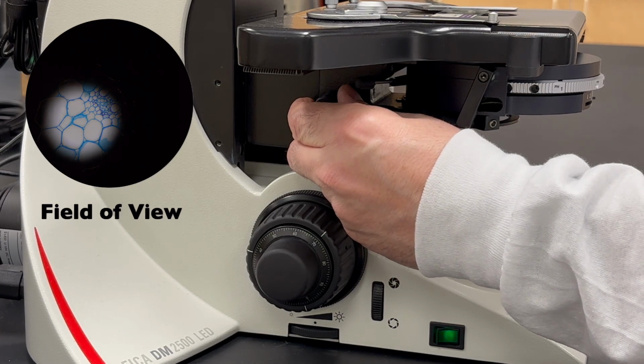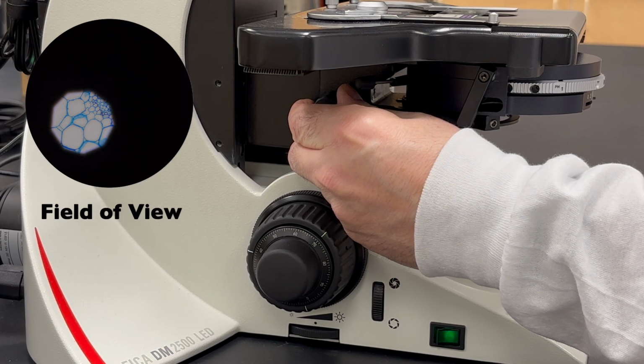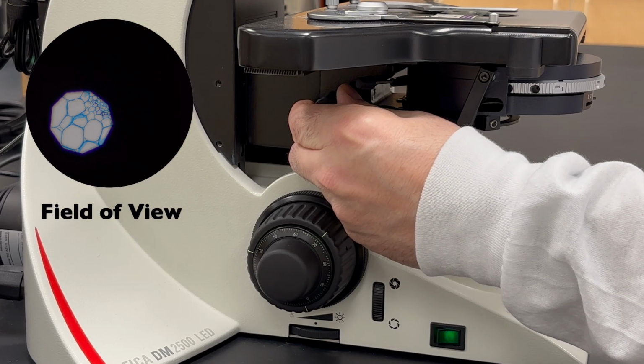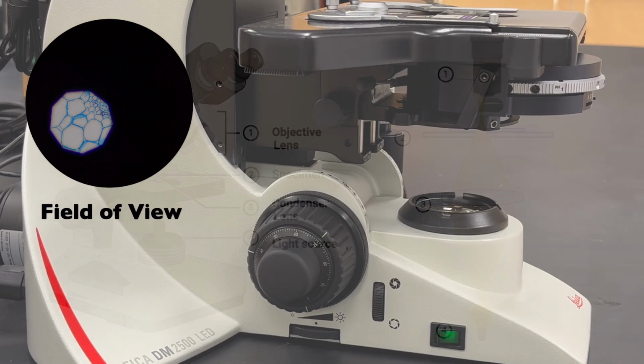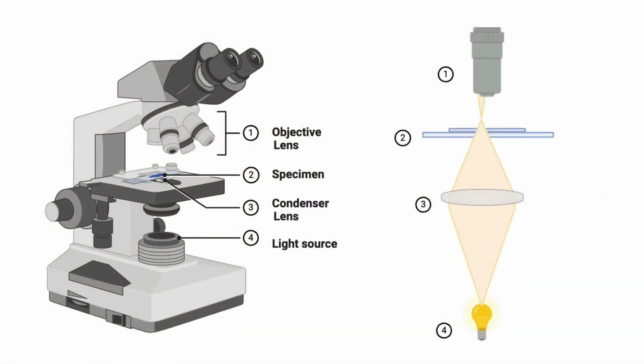It is possible to focus on both the edges of the field diaphragm and the specimen simultaneously, as they are in the same conjugate image planes. The result of these first 3 steps is that the cone of light, which was initially misaligned, has now been optimally aligned with respect to the sample along the z-axis.